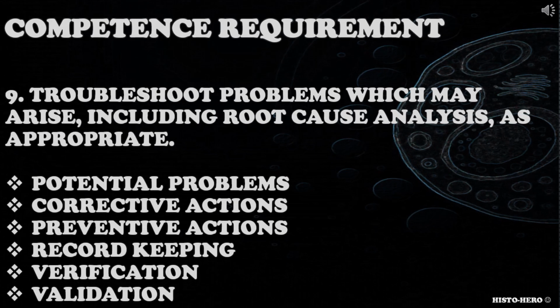The ninth competence requirement is troubleshoot problems which may arise, including root cause analysis, as appropriate. Candidate should be able to troubleshoot, including performing root cause analysis. What problems can the candidate deal with? Can they solve them? Do they know why certain problems occur? Can they perform root cause analysis? Do they know how to record their actions during troubleshooting?